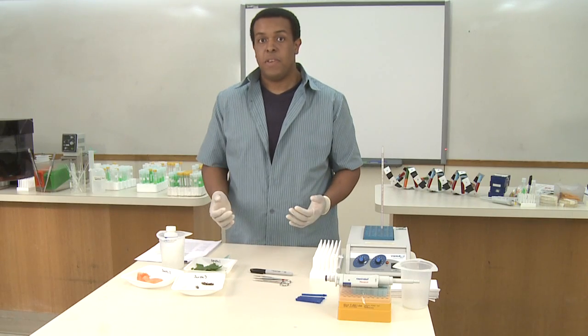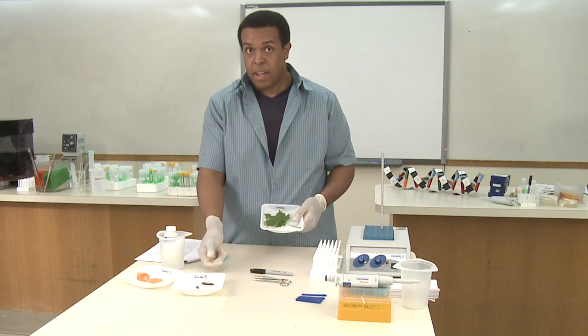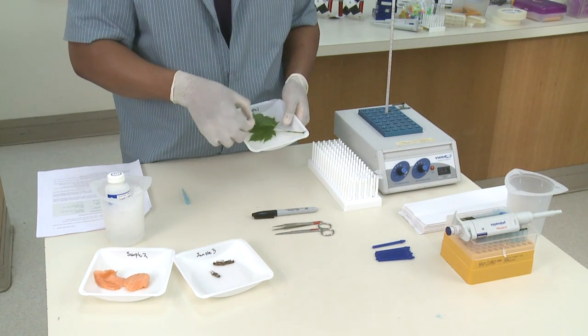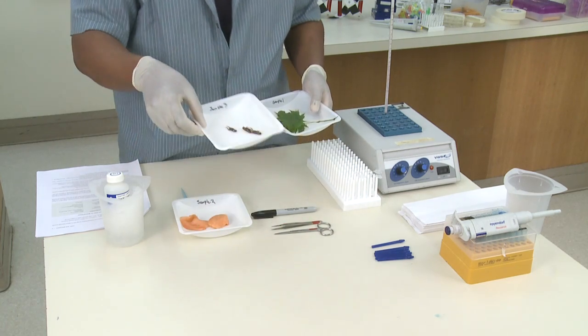To begin the protocol, first you need to get a sample of the individual things that you've collected. In this case, I have a broadleaf from a maple tree, I have some salmon, and I have some insects, which are probably crickets.